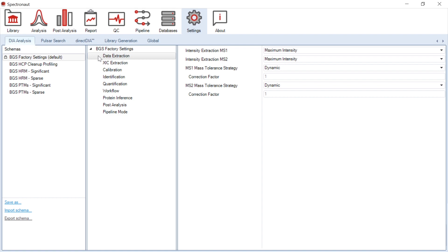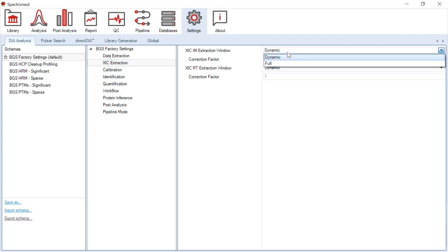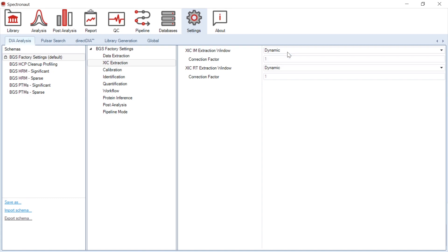The only new setting that is ion mobility specific is extracted ion chromatogram ion mobility extraction window. As a default, you would set it to dynamic, which means Spectronaut will dynamically adjust the XIC window in ion mobility-dependent manner, based on a large sample set during calibration.